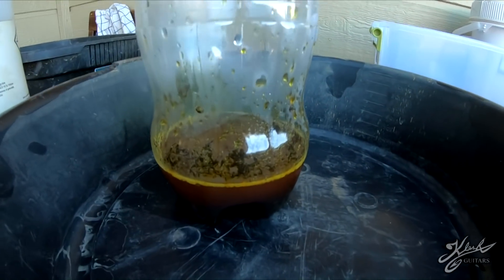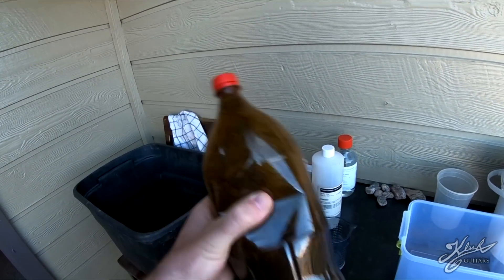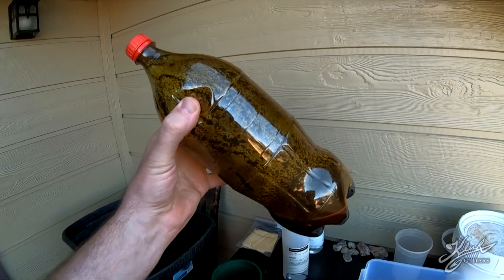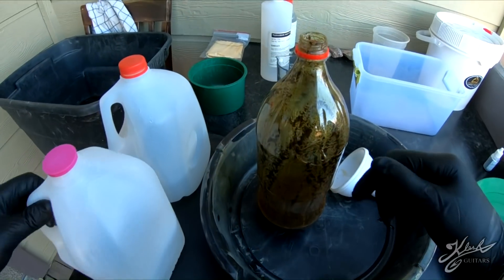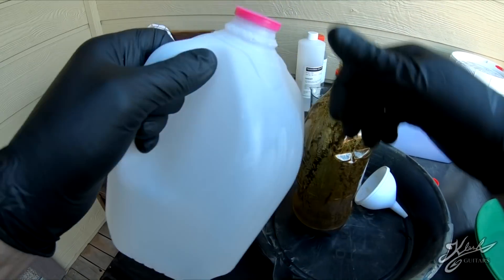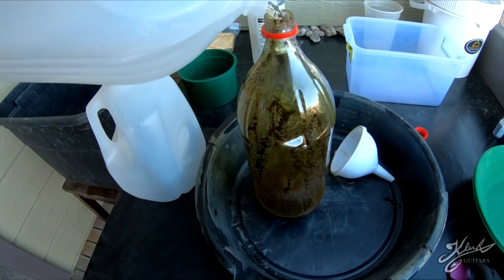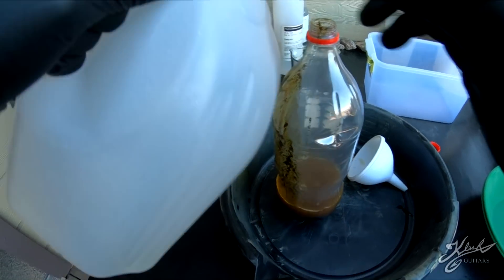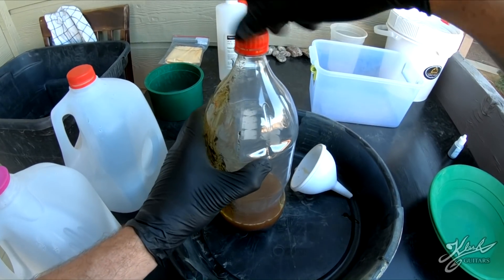All right, that should be enough - you don't need too much. As you shake it up you can actually feel it heating up. What we're going to do is drain this off and then rinse it with distilled water. I'm just going to pour a little bit in there and again shake it up.